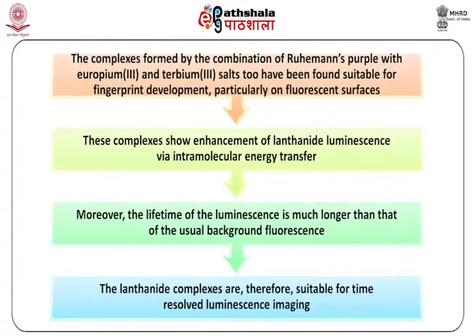The complexes formed by the combination of Ruhemann's purple with europium and terbium salts too have been found suitable for fingerprint development, particularly on fluorescent surfaces. These complexes show enhancement of lanthanide luminescence via intramolecular energy transfer. Moreover, the lifetime of the luminescence is much longer than that of the usual background fluorescence. The lanthanide complexes are therefore suitable for time resolved luminescence imaging.